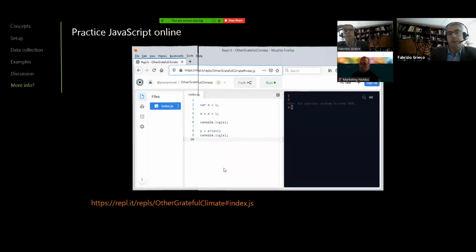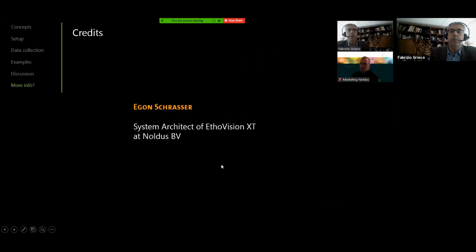And finally, some credits to one of the brains of EthoVision XT who made it possible. Egon made these JavaScript functions in his free time, and apparently it turned out that many of the questions asked by our customers that cannot be answered by normal variables can be answered by using JavaScript. So it became popular within the company, and it is now becoming popular outside. I hope outside among you, or those of you who are going to use EthoVision in the next few weeks or months.